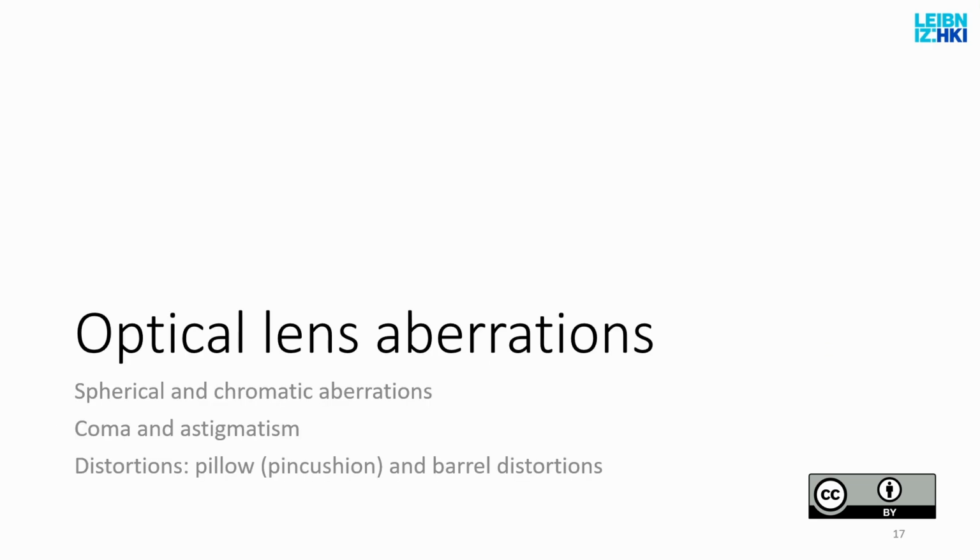Now, we have built a microscope from ideal lenses. Infinitely thin, but surrounded by a perfectly spherical surface. These don't exist, obviously. So we have to deal with real lenses which have limited non-zero thickness. And this leads us to a problem that you will always have to deal with when you do image analysis and you are working with microscopy images, namely that images are not going to be perfect, ever.